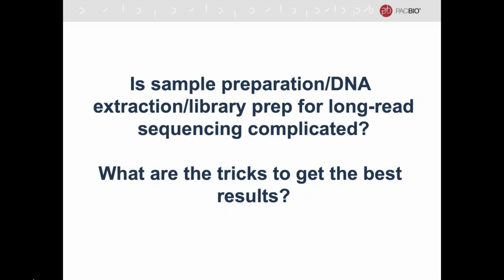I'd like to add something to that. I think not only the methods that Olga mentioned, but how you assess the quality is critically important. So when you're thinking about how to QC your samples to assess whether they're good for PacBio sequencing or whether you're going to submit them to a core like any of us run, really focusing on using methods that specifically quantify and qualify double-stranded DNA is critical. So we use the Qubit HS double-stranded DNA kit, which is our gold standard. Please, please, please try to move away from the NanoDrop.